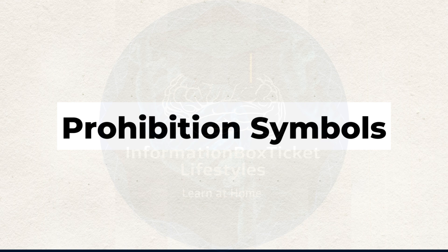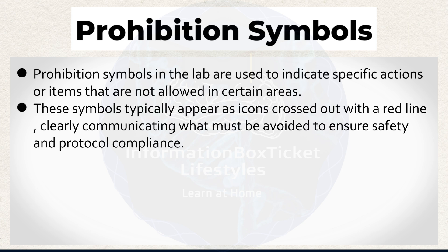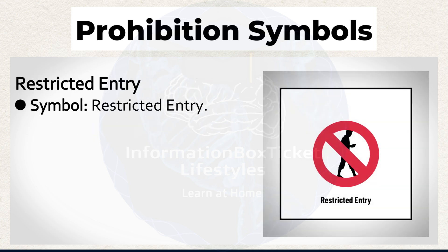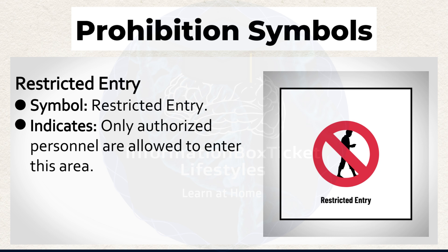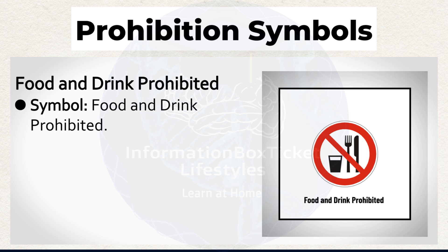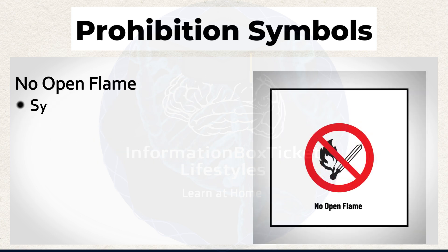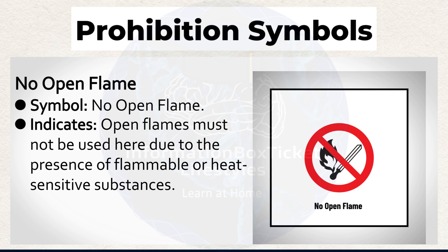E. Prohibition symbols in the lab are used to indicate specific actions or items that are not allowed in certain areas. These symbols typically appear as icons crossed out with a red line, clearly communicating what must be avoided to ensure safety and protocol compliance. Restricted Entry symbol indicates that only authorized personnel are allowed to enter this area. Food and Drink Prohibited symbol indicates that eating or drinking is strictly not allowed in this area. No Open Flame symbol indicates that open flames must not be used here due to the presence of flammable or heat-sensitive substances.